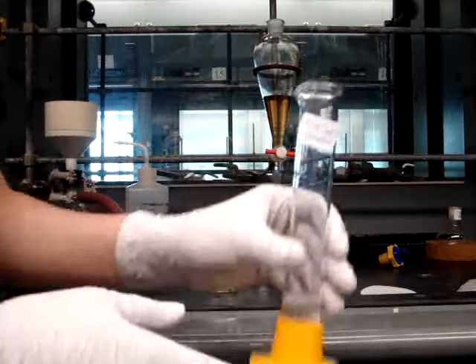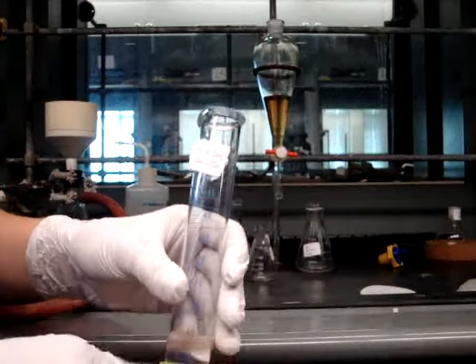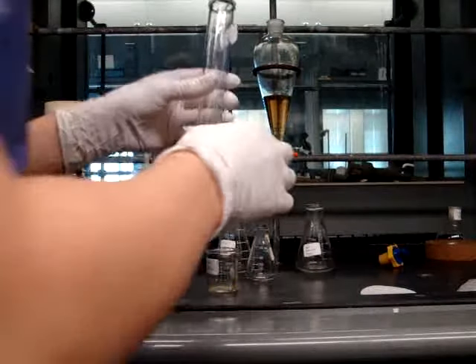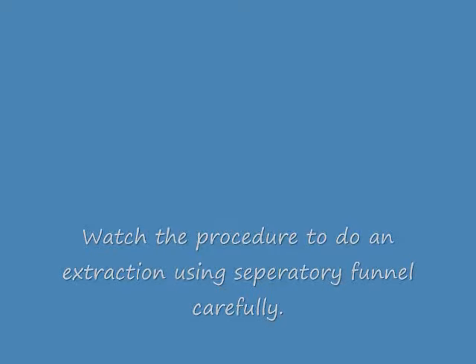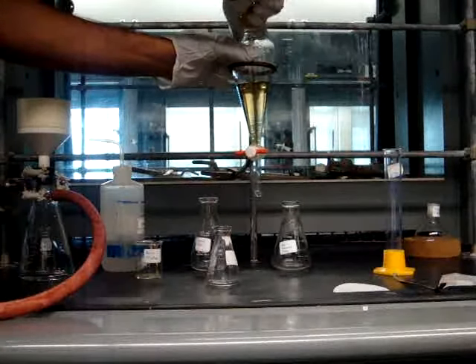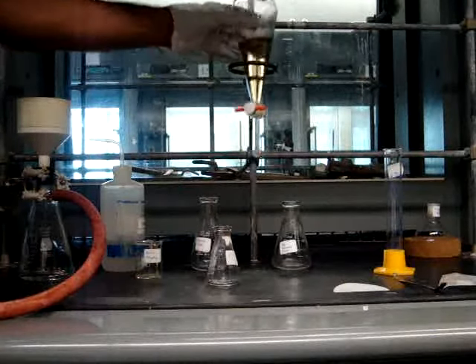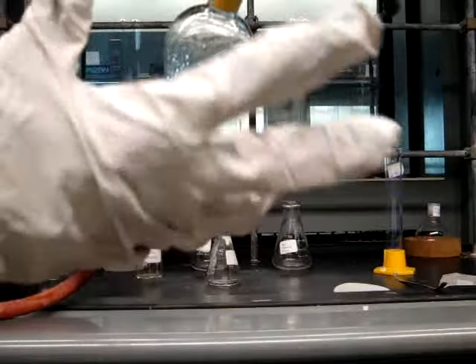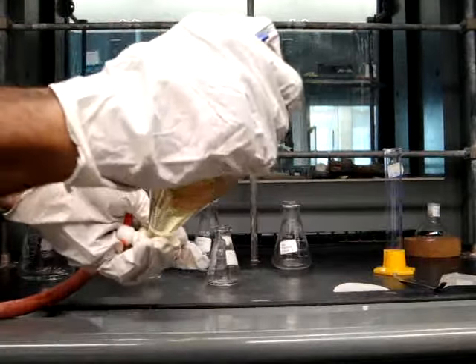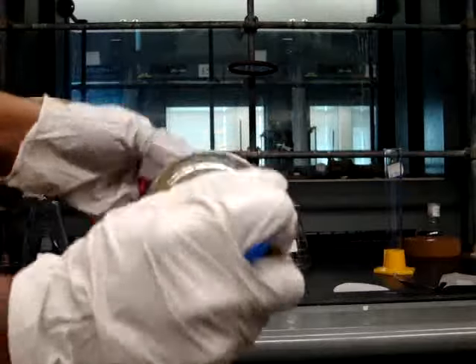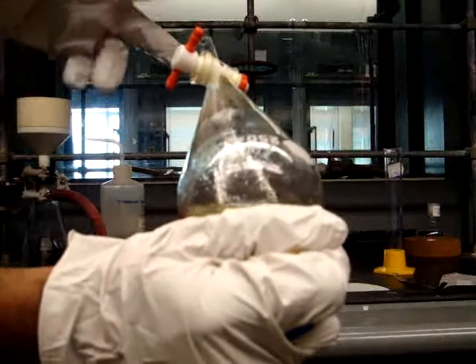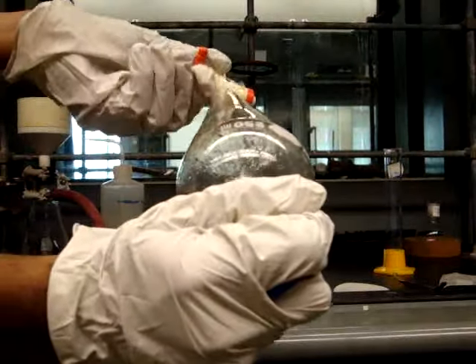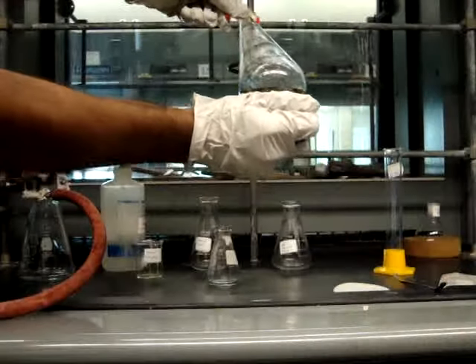Now you want to add your first 15 milliliters of 3 molar hydrochloric acid into the separatory funnel. You want to shake your separatory funnel by removing it from the standing iron ring clamp and placing your fingers on top of the stopper and holding it between your fingers. Now, with your hand clamped on the other side, you want to invert it.